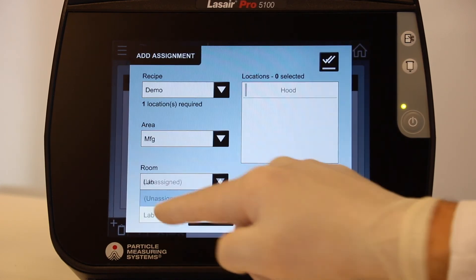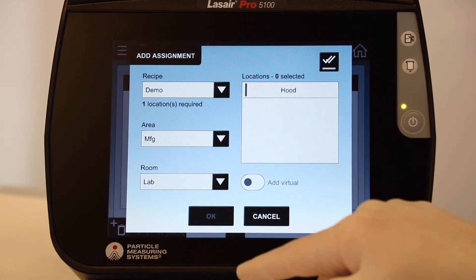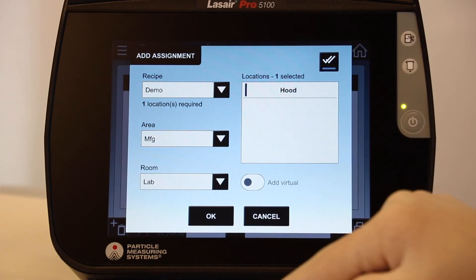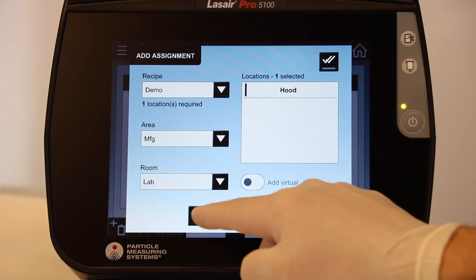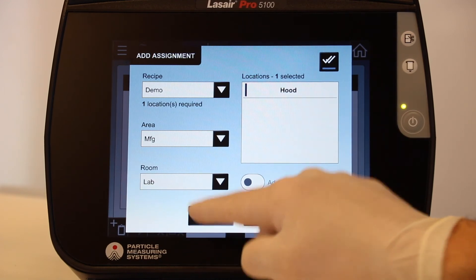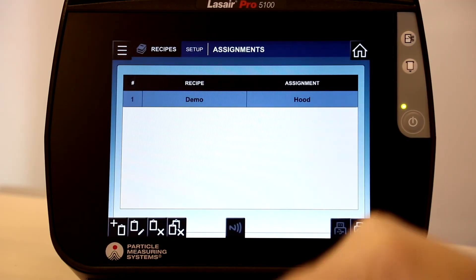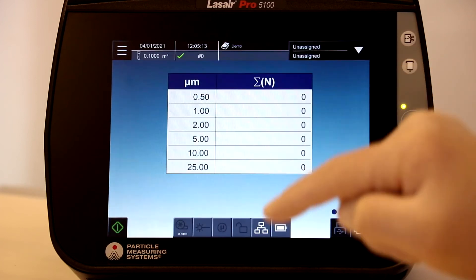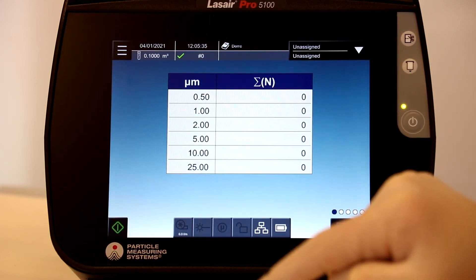In this instance there is only one choice: Hood. We will select this location and then select OK. We will now select the home icon and return to the main display.